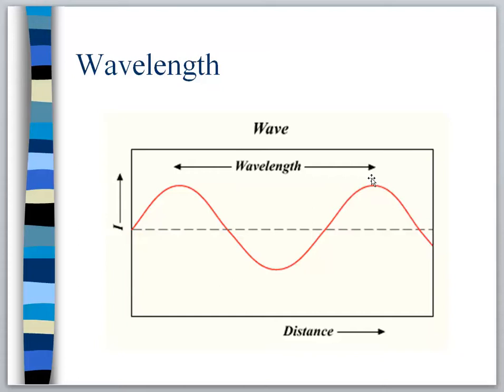And visible, there's a gray area in visible as well. Some people say 800, some people say 900, some people say 1100, but that gray area we just kind of chop off. And the reason that we do that is because this is what makes practical sense in a laboratory. Most of the time when I'm running visible analysis, I don't go above 900. Most of the time when I run UV analysis, I don't go below 200. This is just the working natural ranges of compounds that we see in a lab. So, depending on the textbook, if you begin to look this up through Wikipedia, you might see different numbers, but again, for our purposes, we're rounding off and we're making it simple.